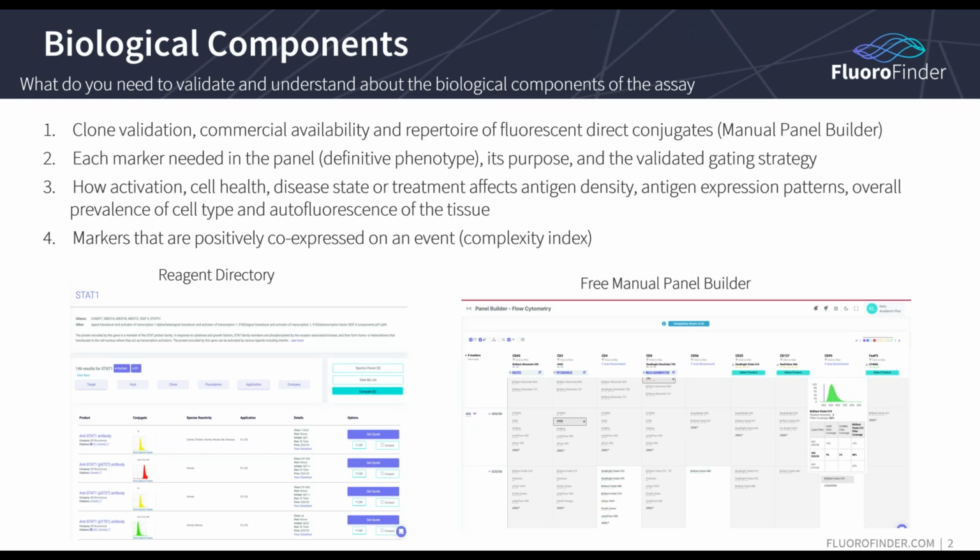Another thing that we often don't think about is the prevalence of that cell type. There is an effort that's been going on for easily over 10 years. I don't even know when the first paper was published, but you can go look into it, or I can send you the link. It's an effort by the HCDM, which is the consortium that determines which antigens receive a cluster of differentiation, or a CD name. It helps us make sure that we don't have redundancy, that the antigen is validated, that it's real. It tests it by fire.